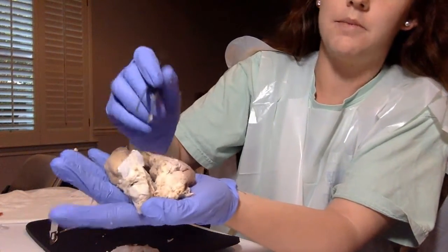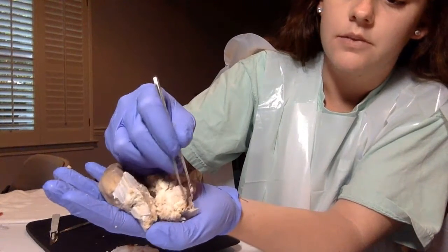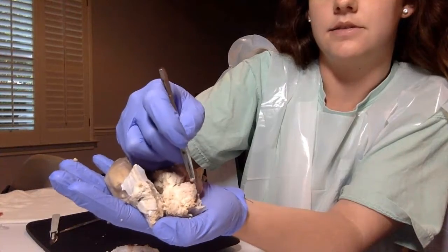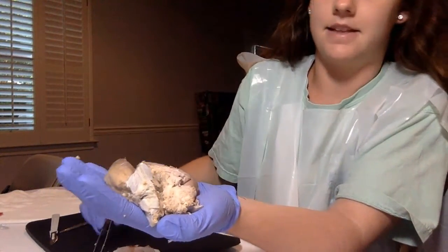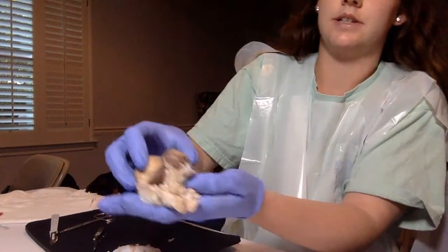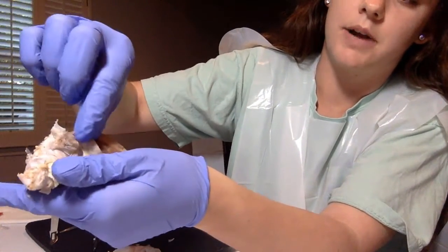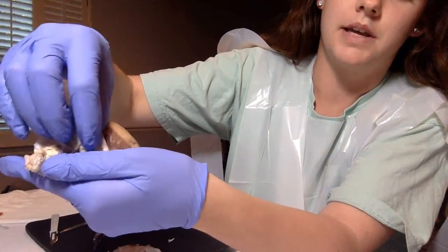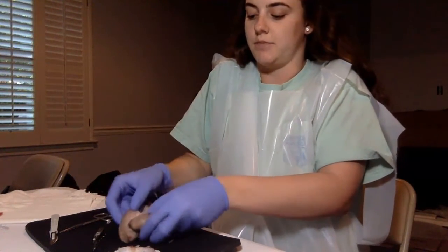And then the white matter is the matter that's kind of white, or gray matter that's kind of around the arbor vitae, what it's kind of surrounding. And then the meninges, which is the protective layer over the brain. And you can see where I cut it to help see the inside of the brain more, and there are different layers of the meninges, and there is one of the layers that would be over the brain. And that is the sheep brain dissection.